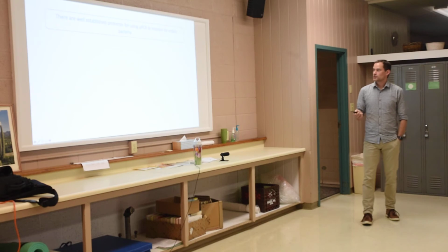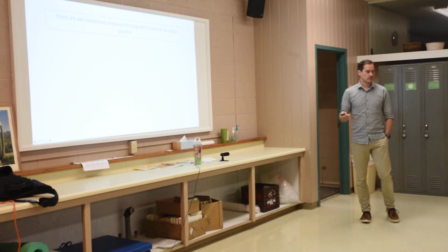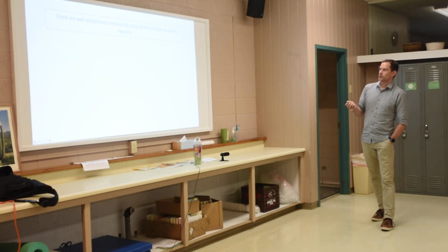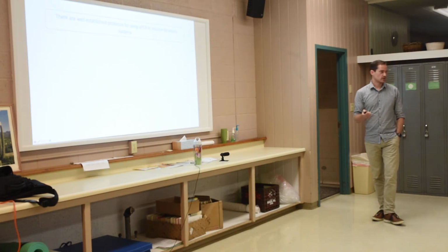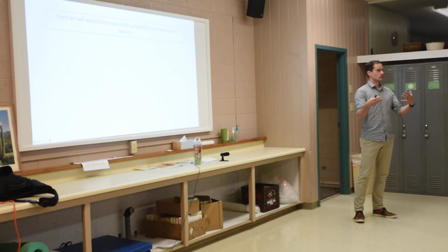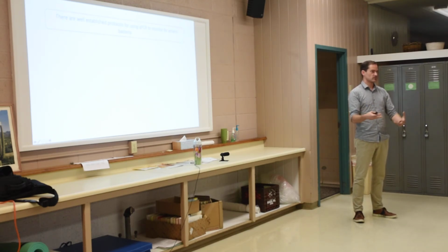So I want to quickly do a little summary, and then I'm going to talk to you a little bit about our sort of longer-term visions here. So there are well-established protocols for using qPCR to monitor enteric bacteria. This is really important because for the swimmer's itch test, this is stuff that we've been working on as a research project. We've been designing these tests.